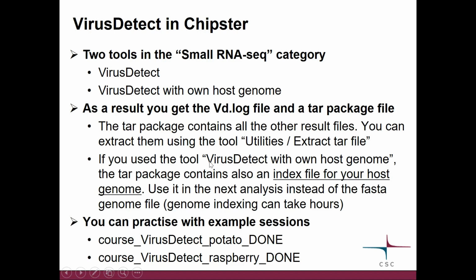And then one more thing which is important if you are studying an organism, a host for which Chipster doesn't offer the genome, and you need to give it yourself as a FASTA file.